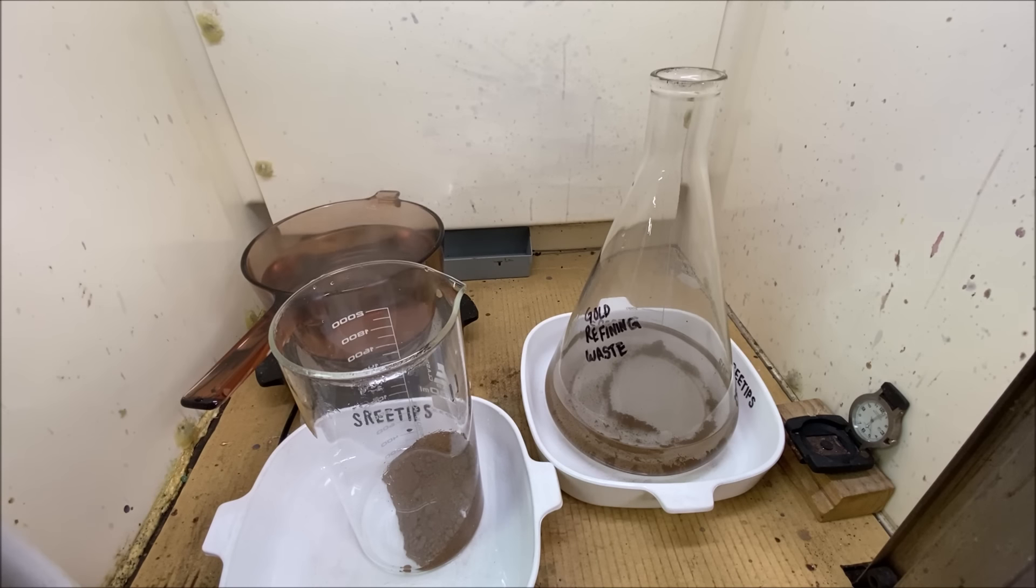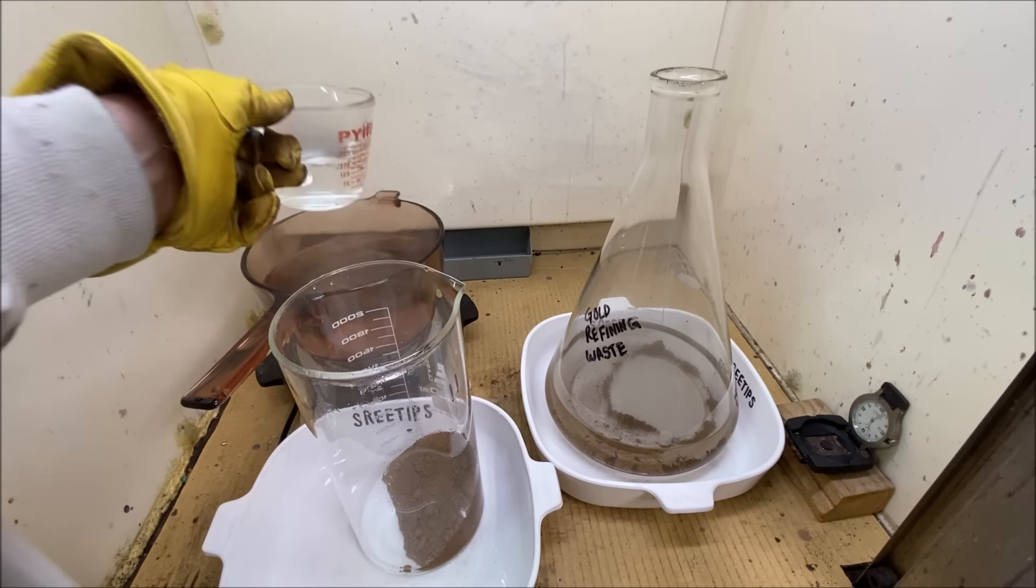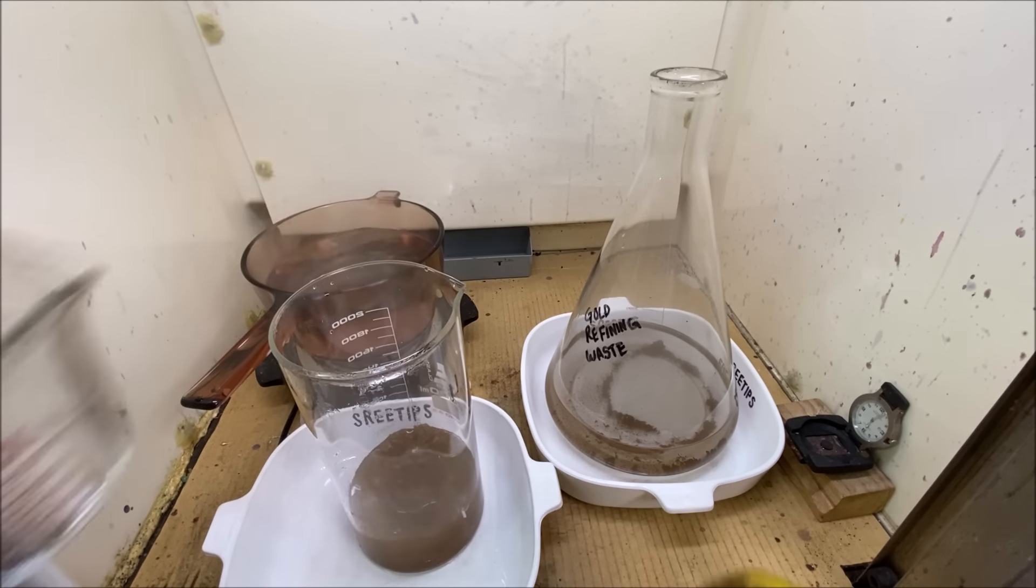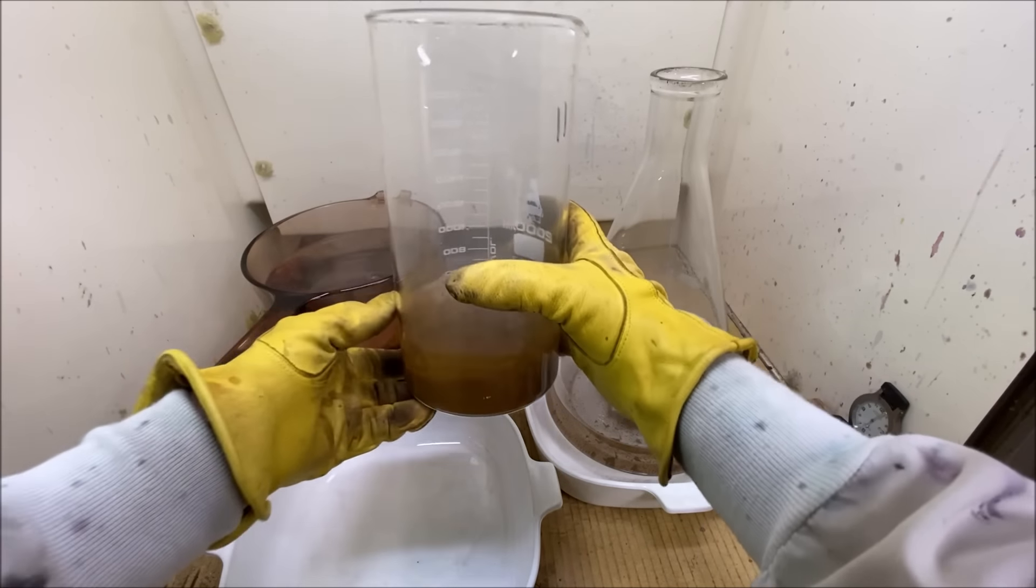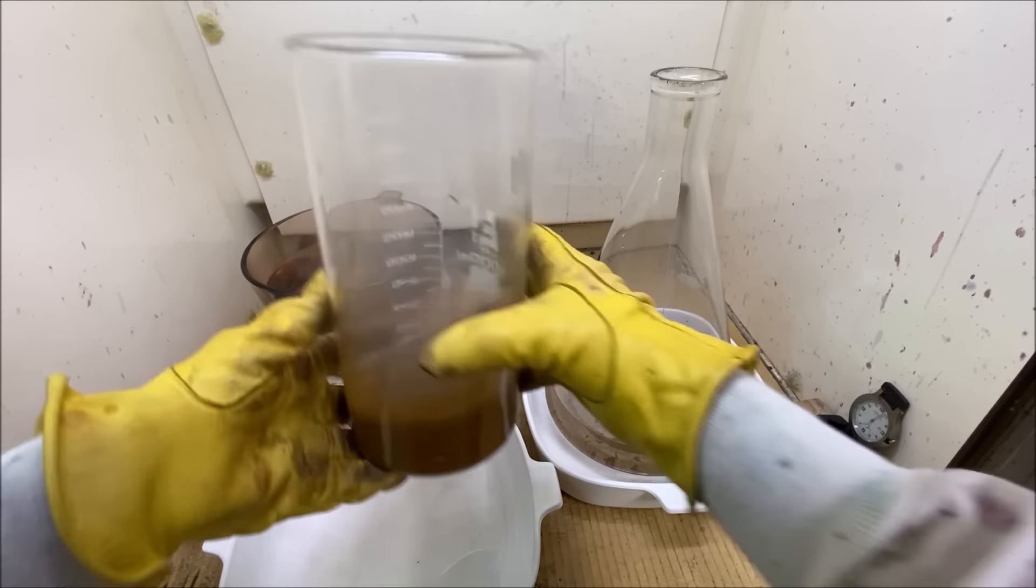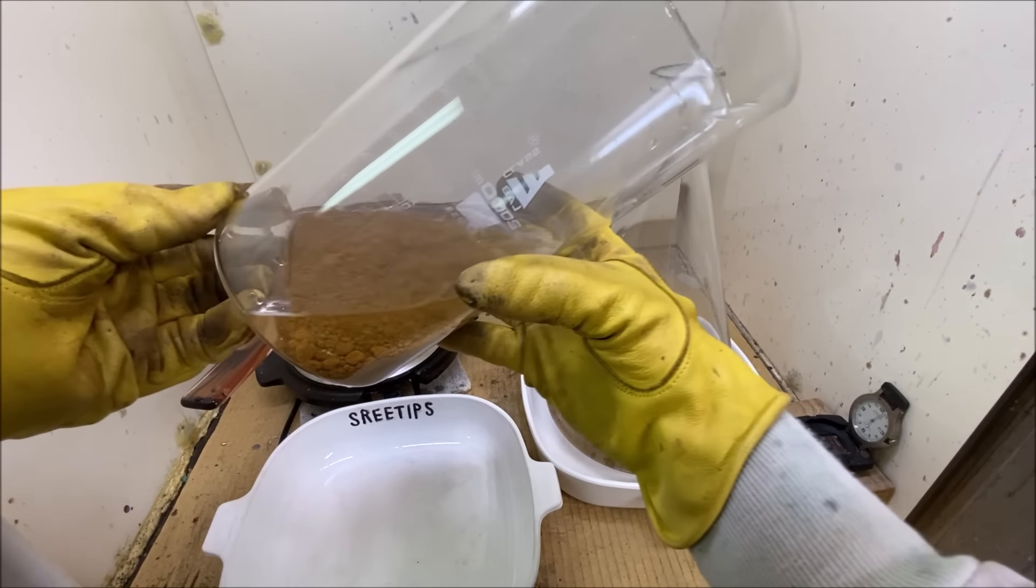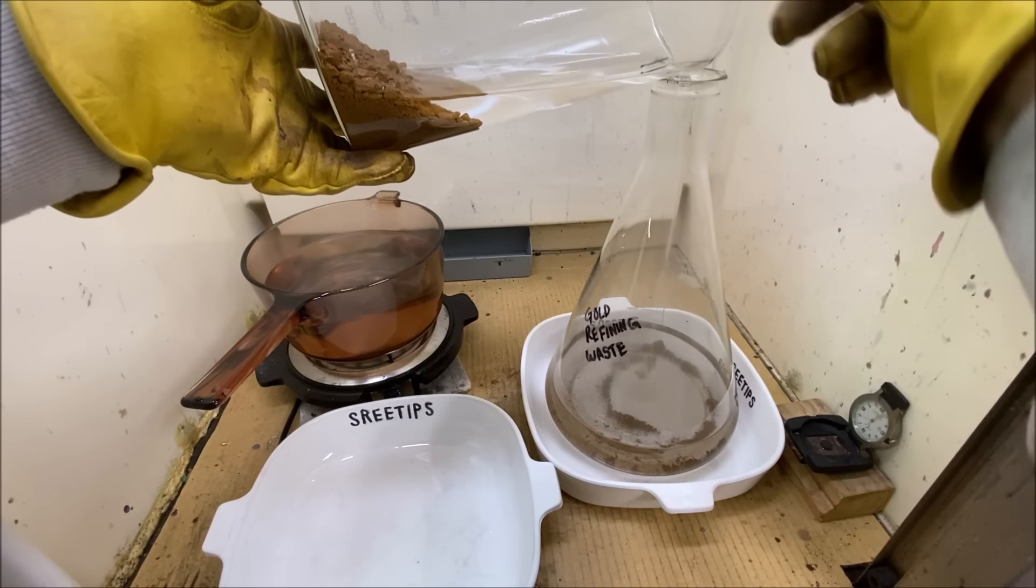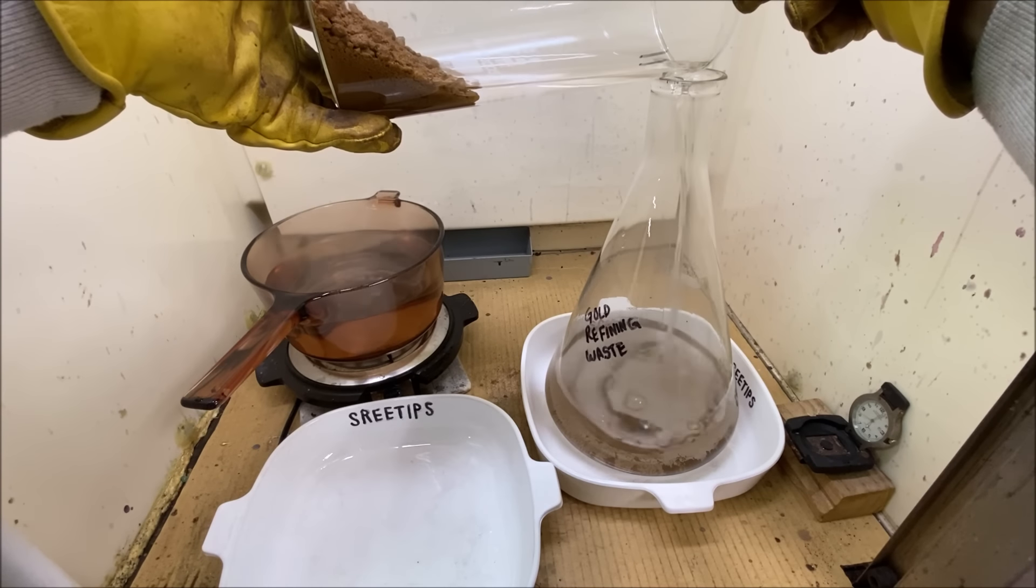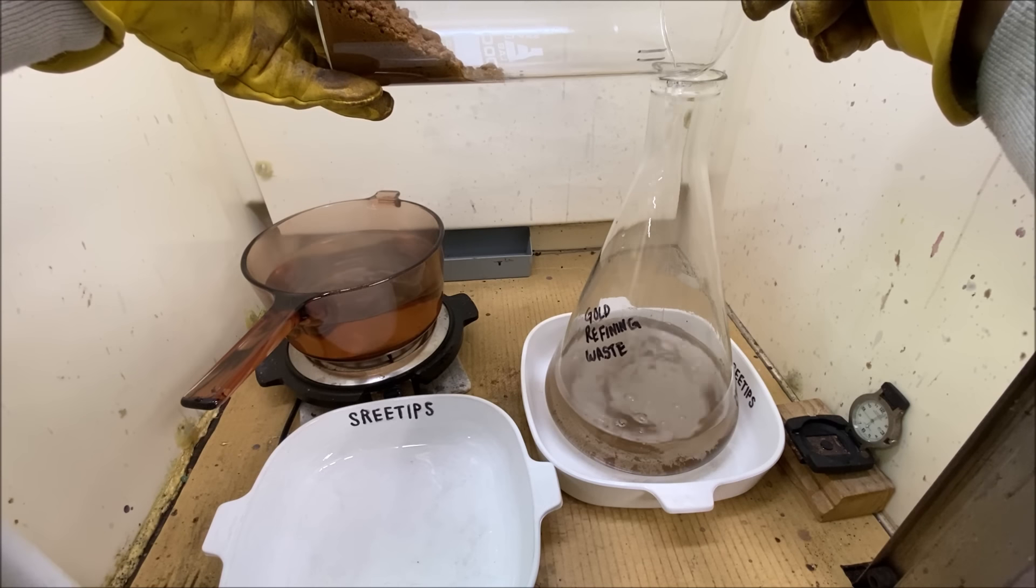I think I've got all the junk rinsed off of the gold now. We've done multiple hot water rinses. This is tap water back here and the gold is settling out real nice. I think we're at the place we go to the next step.